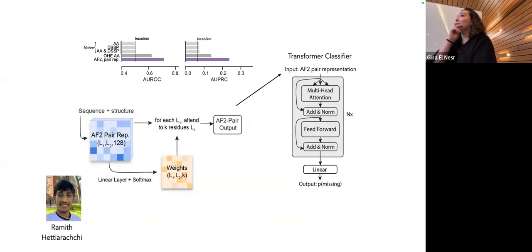Yeah. We tried MLPs, we tried transformers. The transformer worked better because I think it had more weights to actually try to compress everything in the protein representation. Did you train the classifier? Yes.